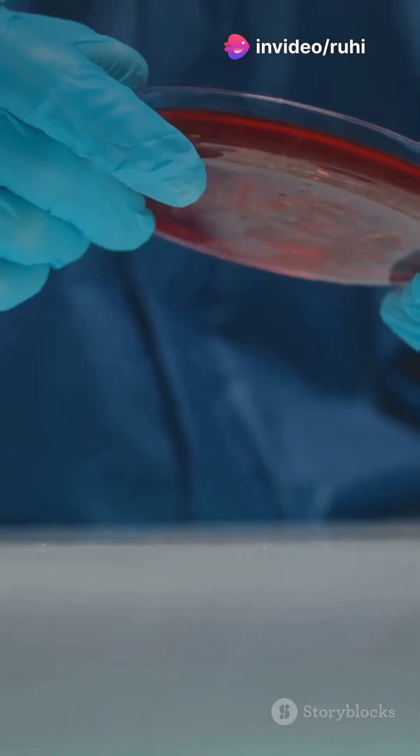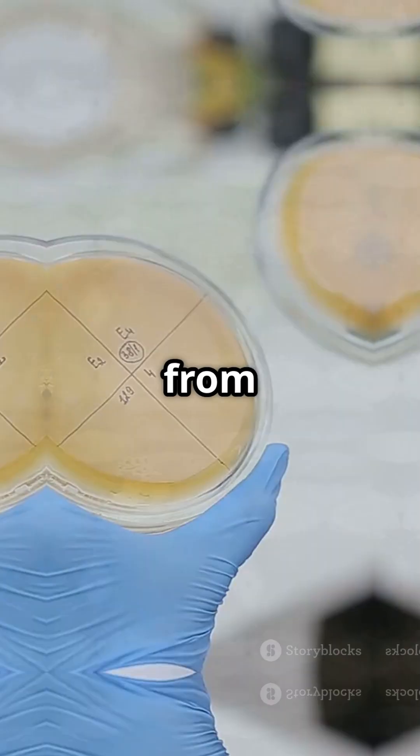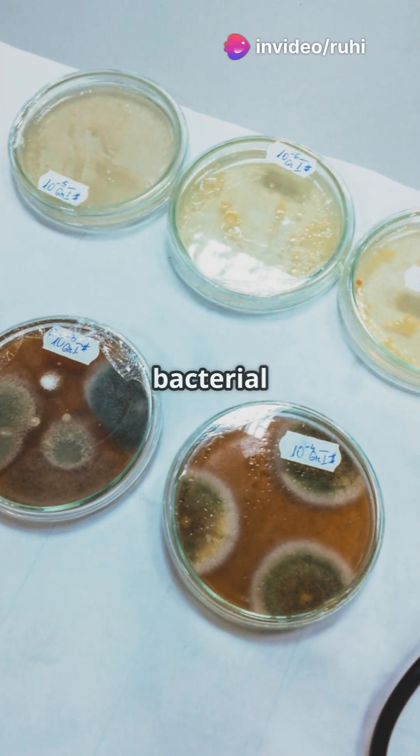Let's not stop there. Next up is streaking. Using a new sterile loop, we'll take a bit of bacteria from one colony and streak it across a new agar plate in a zigzag pattern. This isolates pure bacterial strains.